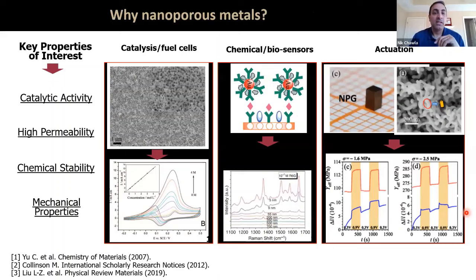Okay, great, thank you. So let me show you an example that we've done recently where I think some of these challenges will come to the forefront. We're looking at nanoporous materials. This is a collaboration with Bruno Azeredo, also at the Polytechnic School at ASU. You can use this for biosensors. We can use it for fuel cells and catalysis.